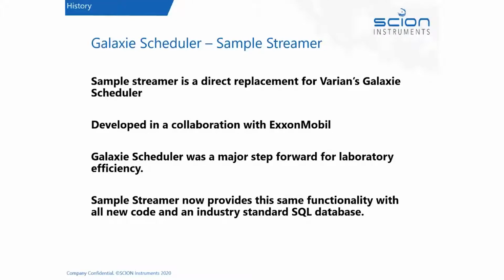So today what we will do is I have a short presentation just now, and then we have a small demonstration at the end where we will run the software and we can talk about some of the features.